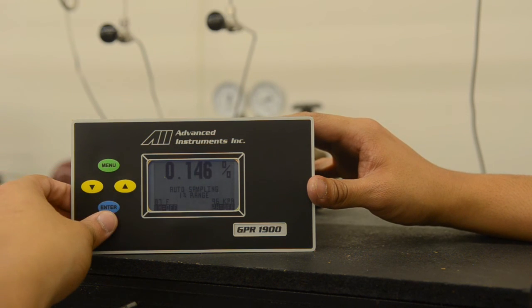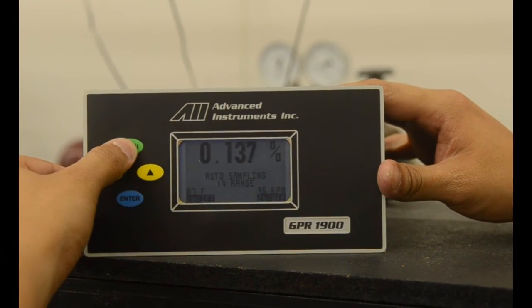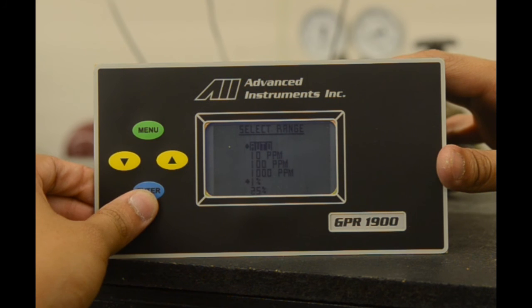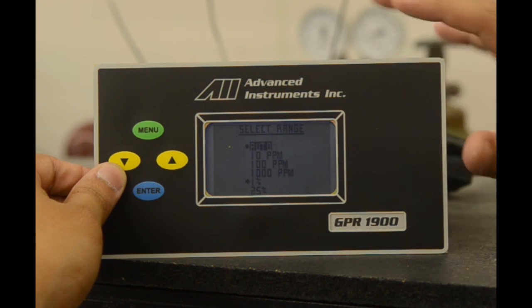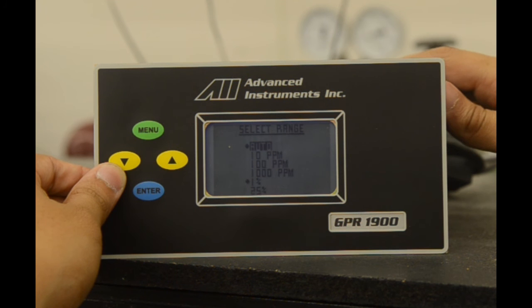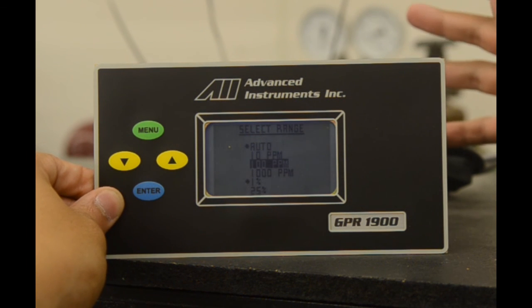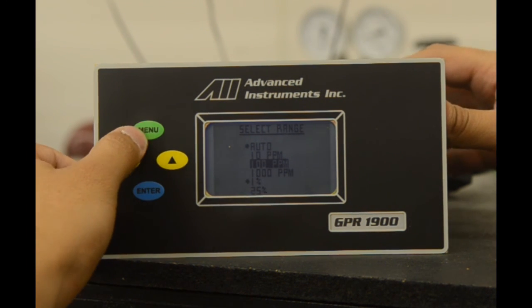We will now go with the select range option. Hit menu, scroll down, select range, and select enter. As you can see, currently it is in auto ranging at one percent. This is indicated by the two dots along auto and the one percent range. We will scroll down and select 100 parts per million, and this will lock the range at 100 parts, manual sampling.